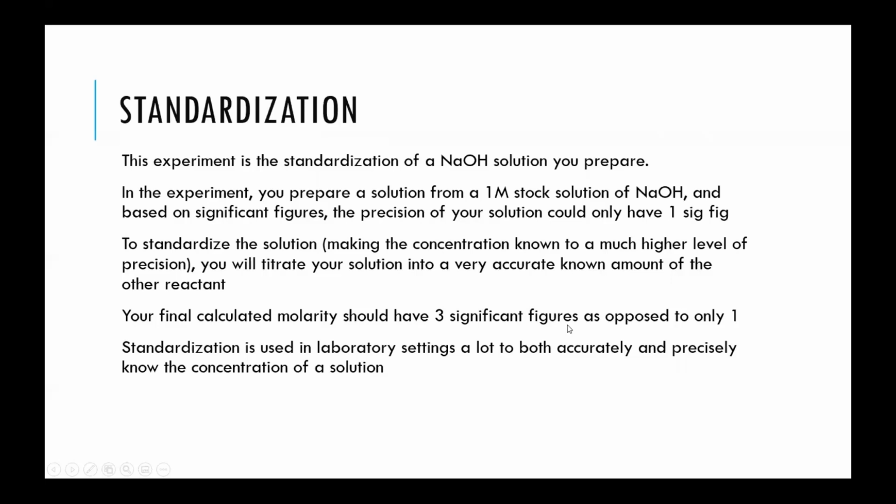Laboratory settings use this a lot when you're preparing a solution and you need to know exactly what the concentration is, not just an approximation, but an exact concentration that you would be using out to a much higher level of significance and a much higher precision.